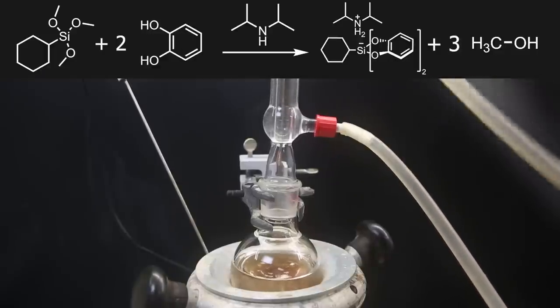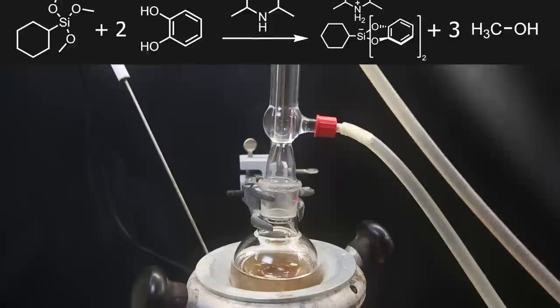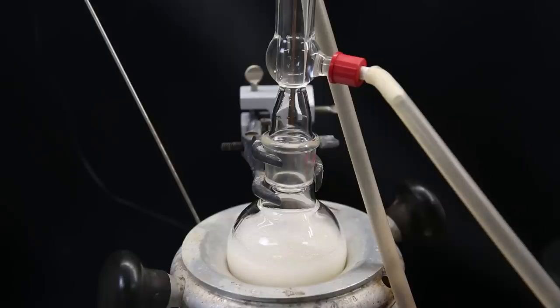Since there are only three methoxy groups to react with, one hydroxyl group of the catechol instead gives up a hydrogen atom to diisopropylamine and binds to the silicon, giving it a net negative charge, while the diisopropylamine now has a net positive charge. These charges can balance each other to form the salt diisopropylammonium bis(catecholato)cyclohexyl silicate. Anyhow, when I come back, the mixture has turned completely white. This is because the product is precipitating out of solution.